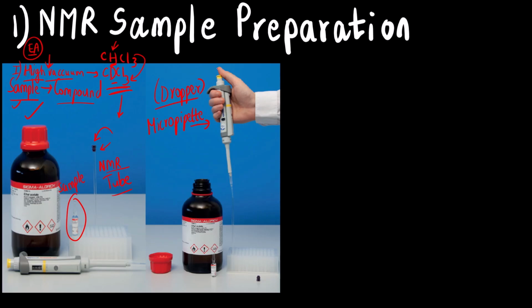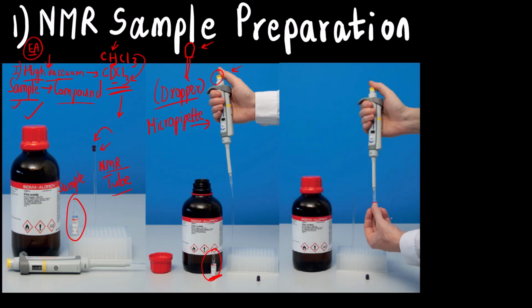First you press the bulb. Let's say this is a dropper. First you will press the rubber bulb. Similarly here there is one knob that you have to press. Then you dip it in your sample. You press the knob, then you dip it and then you release it. As soon as you release, your compound will go into this tip. This is called the micro pipette tip.